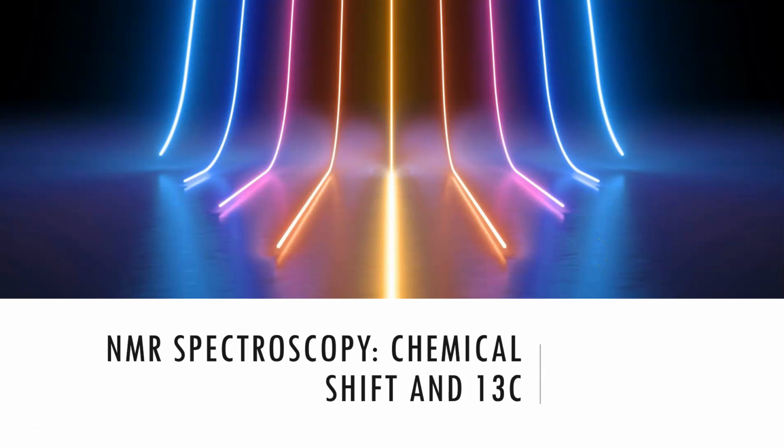Hi, and welcome back. We're going to continue looking at nuclear magnetic resonance spectroscopy today, and we're going to reinforce some of the ideas that we talked about in terms of the N plus one rule and how the peaks split, but also look at chemical shift and what that tells us about the molecule that we're looking at.